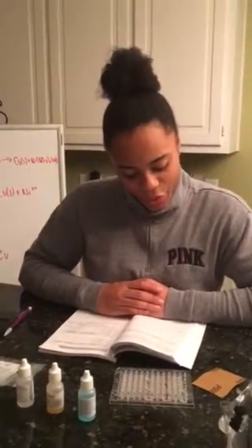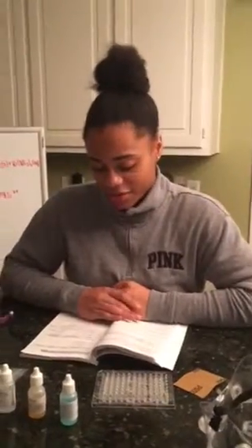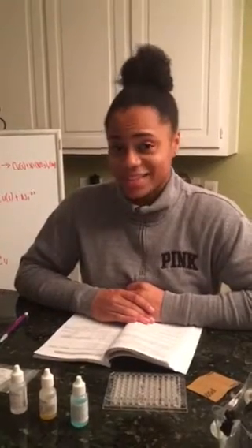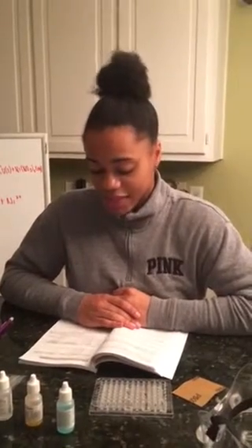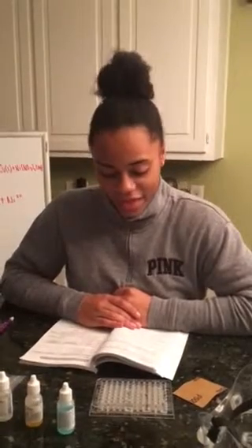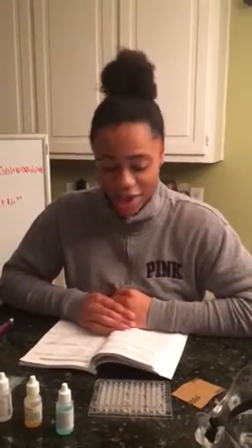For the next step, I recorded which metals were oxidized and the respective oxidizing agents. For the metals, there were copper, iron, and zinc, as we said before. Was the metal oxidized? Yes, each of the metals oxidized. The oxidizing agent for the copper was the iron nitrate. The oxidizing agent for the iron was also the iron nitrate. And the oxidizing agent for the zinc was the copper nitrate and the iron nitrate.